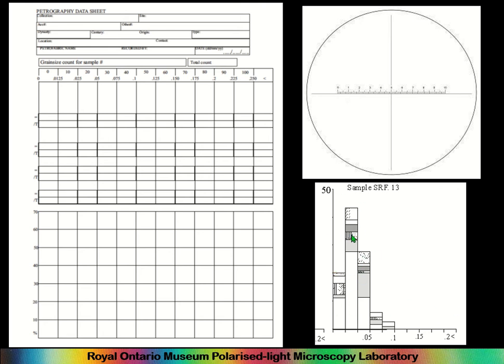And when you do it as a block, as opposed to a line graph, you can just do what I do. I've always felt that it is pointless to collect data you do not intend to publish. So measuring every grain and then working out this graph from that is a lot more unnecessary work than just eyeballing which of the columns it belongs in.